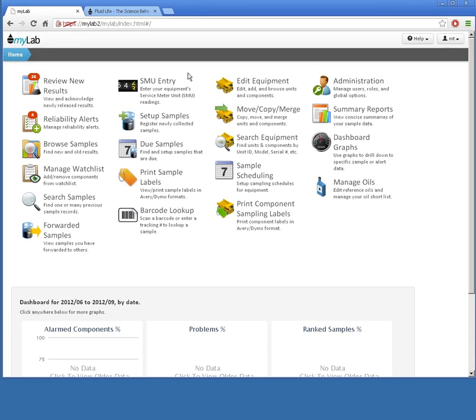Hello! In this video, I'm going to show you how to review your new oil analysis results in Fluid Life's myLab. Reviewing your new results and responding to them by taking the correct actions is central to a good reliability program. In myLab, there's a task for that.